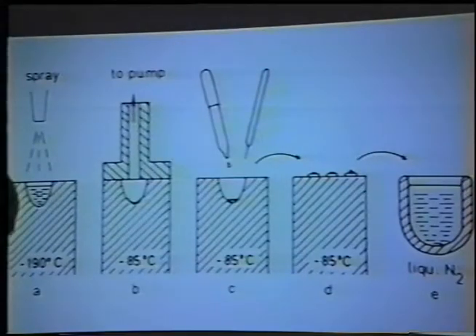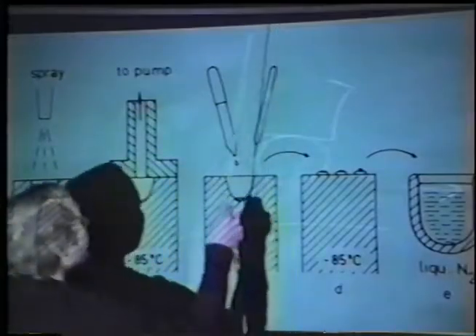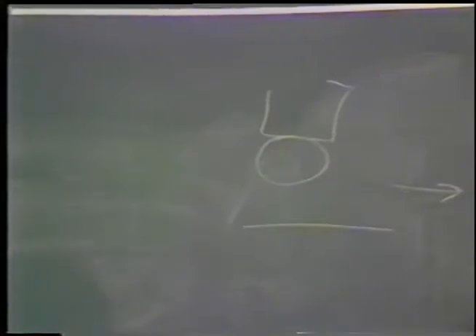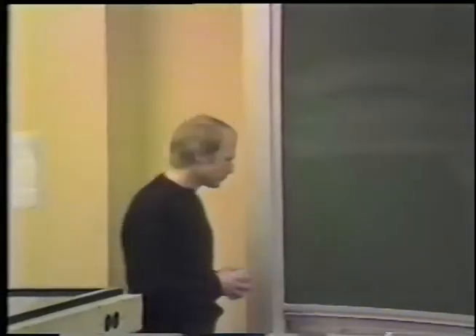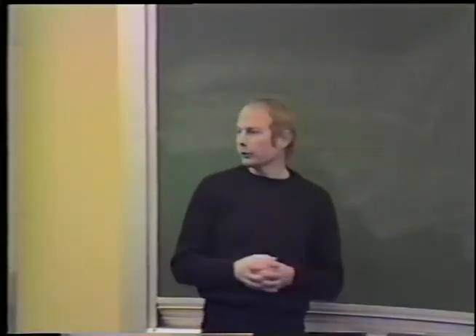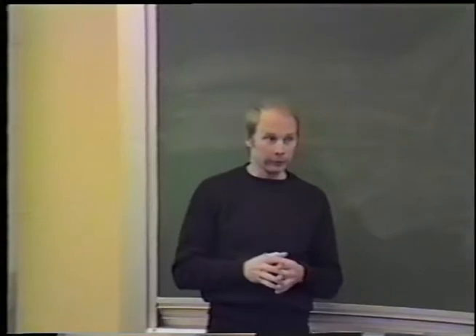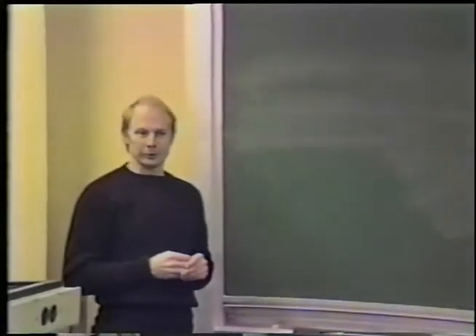All right. Now, that's one major technique, using a cold metal block. The more common technique is to use a liquid cryogen of some sort. And in this case, you want to move the sample rapidly relative to the cryogen in order to maximize the rate of heat transfer. All of the cryogens that are used are gases at room temperature.